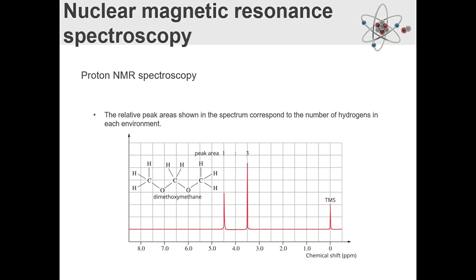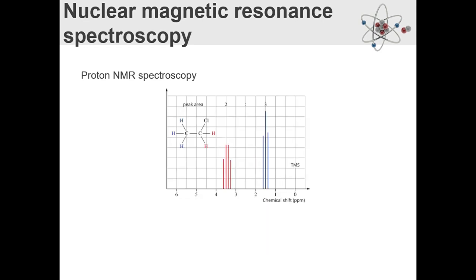All right, as the next one says. All right, let's have a look at this one, because this is showing us something a little different. Why are there 4 peaks here? Why are there 3 peaks here? Well, this is a thing that is quite significantly more unshielded.